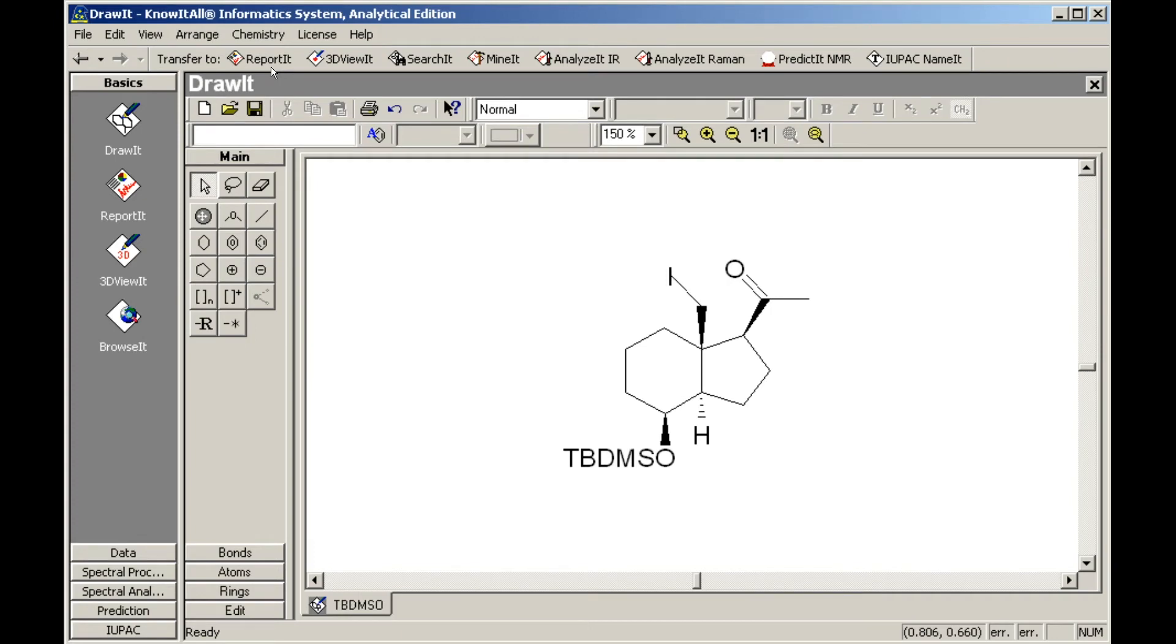We begin with the structure created using the Draw-It application. Click the Report-It button in the transfer bar to transfer this structure to the reported application.